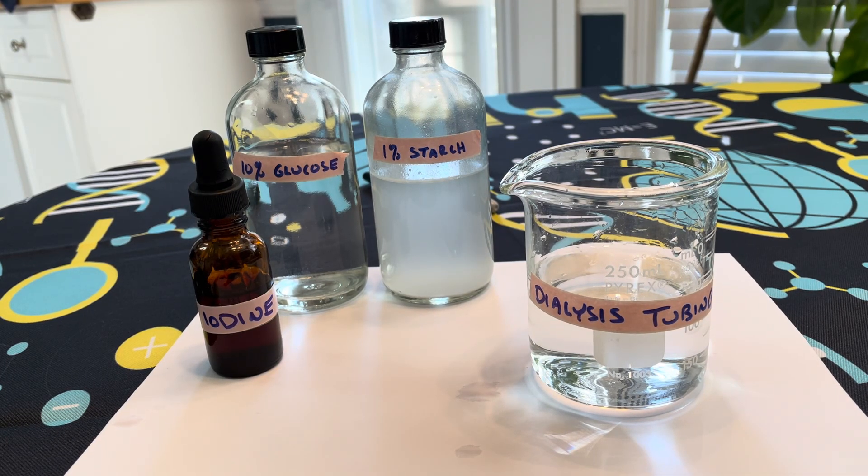Hello, Biology 112. This is Joy Colley. Today we're going to take a look at a diffusion experiment that starts on page 27 and continues on page 28 of your lab manual.